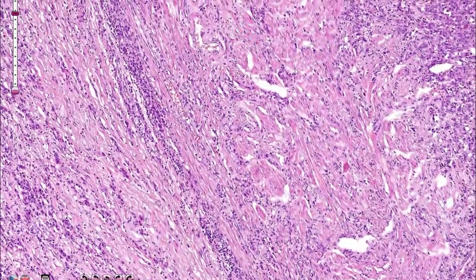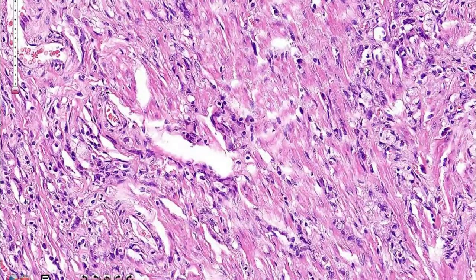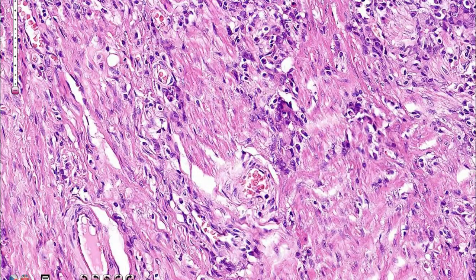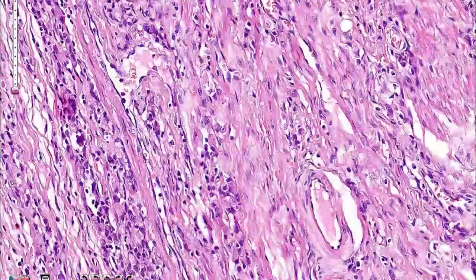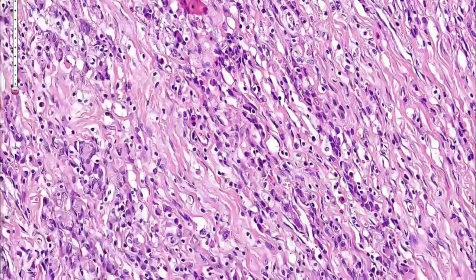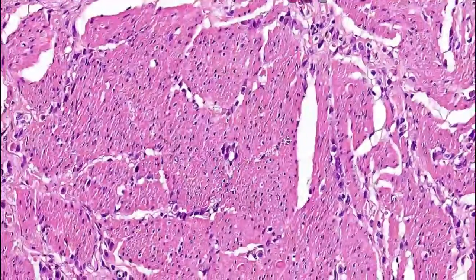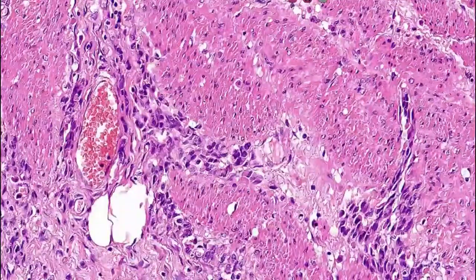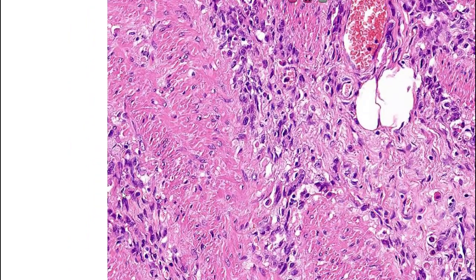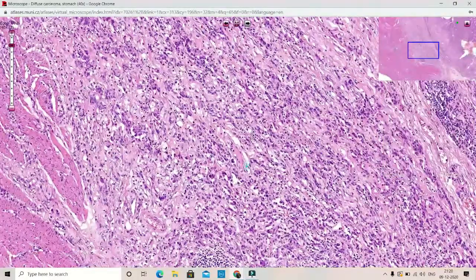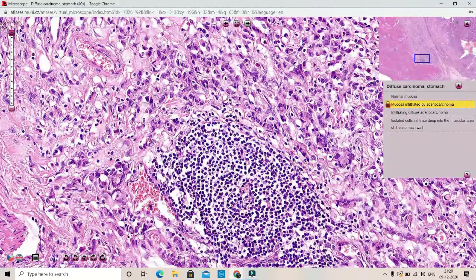Below the mucosa you can see the muscularis mucosa, and when you zoom in you can see these adenocarcinoma signet ring cell type cells infiltrating the muscularis layer. The tumor is infiltrating all the layers of the stomach, extending to the serosal aspect. There is also a chronic inflammatory reaction — you can see the lymphocytes and inflammatory cells here alongside the signet ring cells.